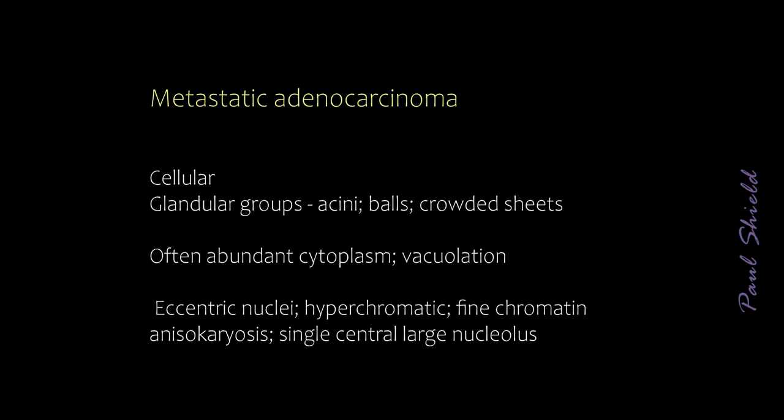So that's the most common pattern really, the classic adenocarcinoma pattern, and that accounts for the vast majority of metastatic adenocarcinomas in effusion specimens. However, there are a group that show different and more subtle changes, and that'll be the subject of the next clip.